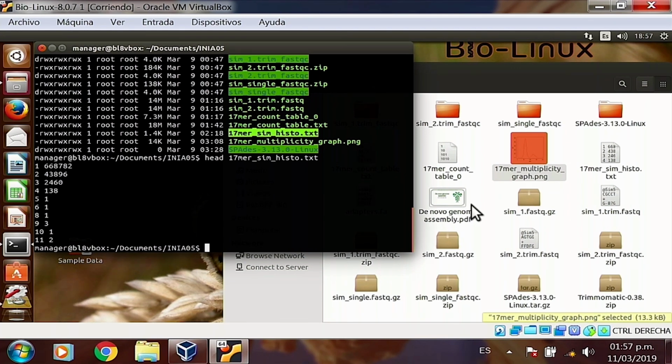So you would expect that most true Kmers would appear around a value that you had already estimated as the sequencing depth. Remember that based on your filtering, the number of reads and the number of base pairs per read, you could estimate how much sequencing you did.